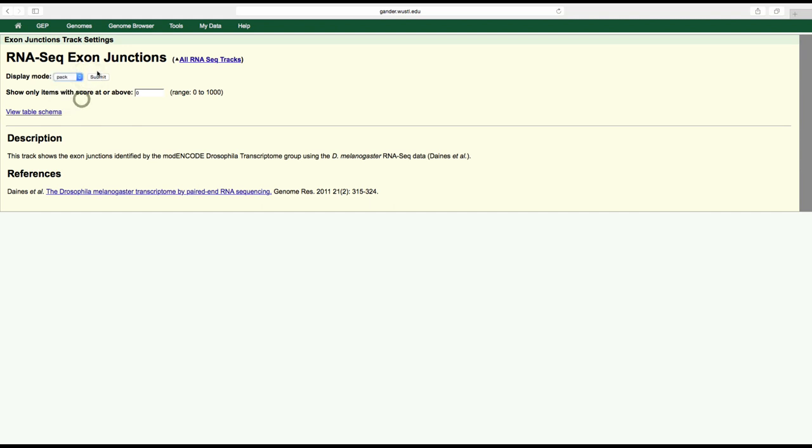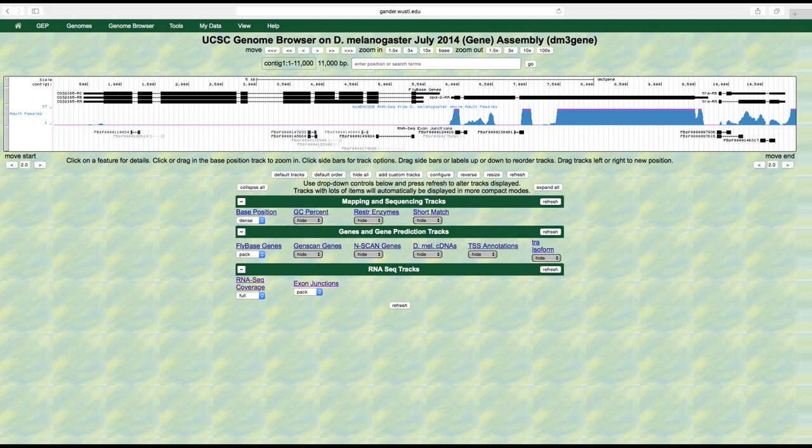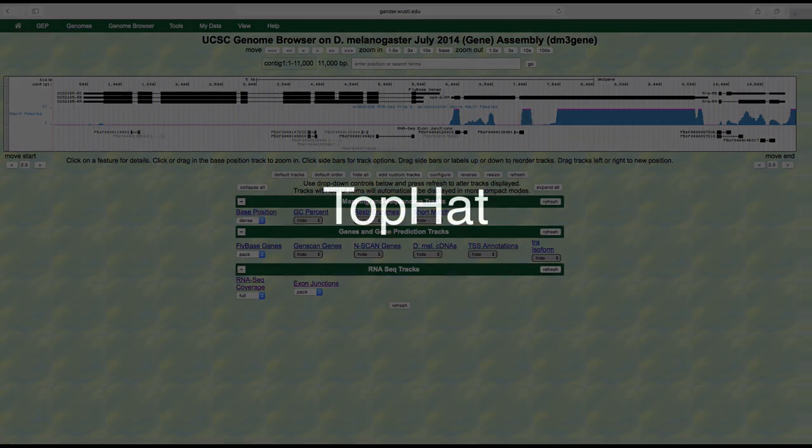We can examine the splice junction predictions more carefully by zooming into the five prime and three prime end of the exon. Several other tools can help us analyze splice junctions. TopHat is a program that can identify splice junctions without relying on a database of known junctions.